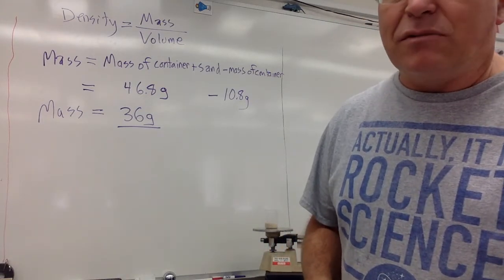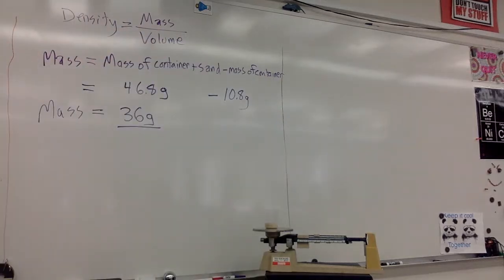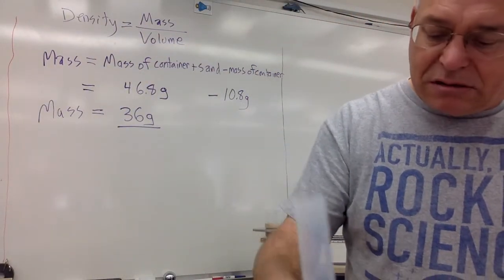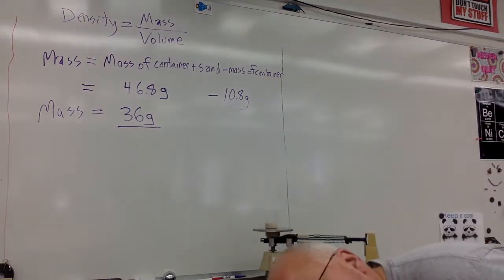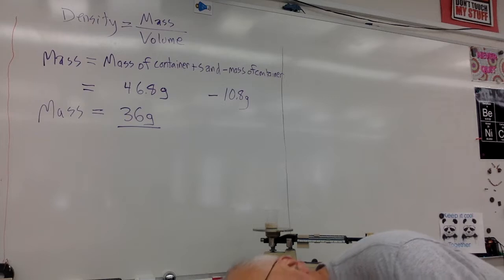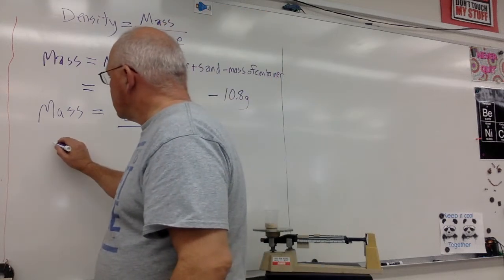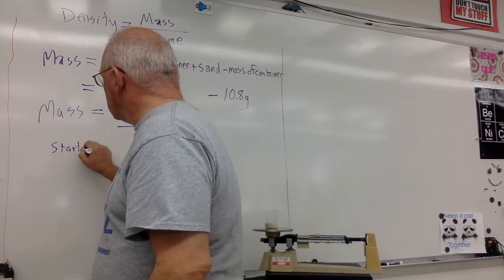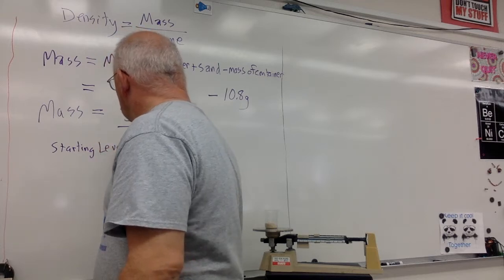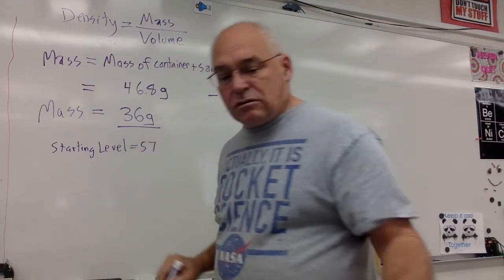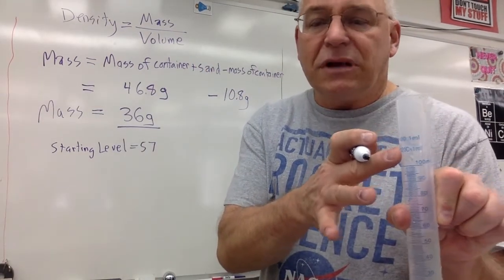Now, to find the volume of the sand, I need to put some water in my graduated cylinder. You've got to read it, put it on a horizontal surface, read it carefully. And that comes out to 57. So I'm going to put the sand in the graduated cylinder. Milliliters.